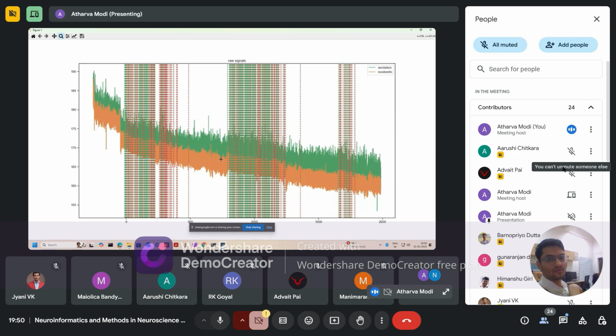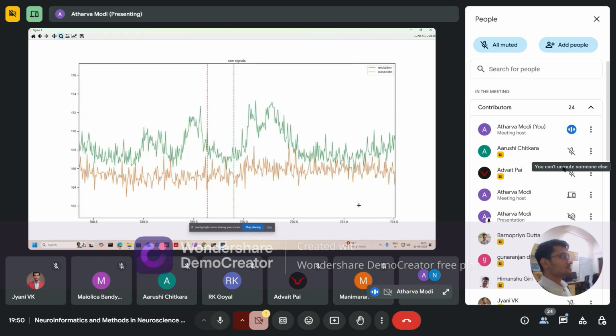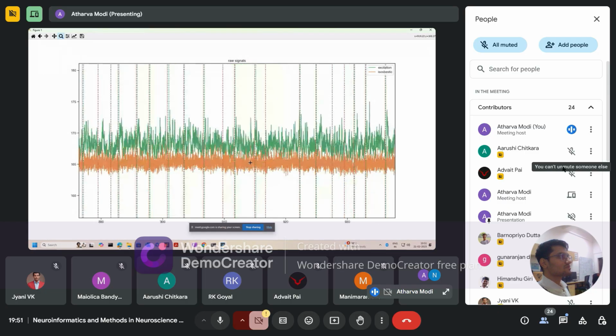So for example, these kinds of dips you see here, if I zoom in to some level, you see these dips are correlated somehow. This kind of wavy pattern is seen in both my control signal as well as the excitation signal. I can zoom in more, basically to a 1 second scale. I will show you some readings here. You will find it interesting that in the raw data also you can see some kinds of readings.